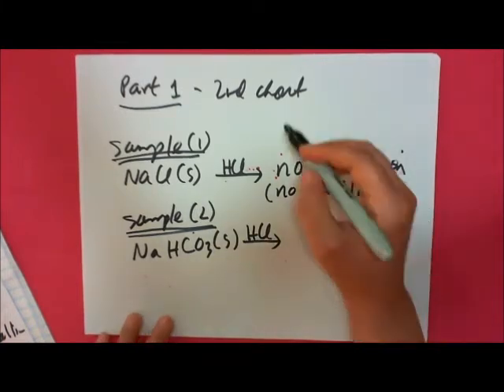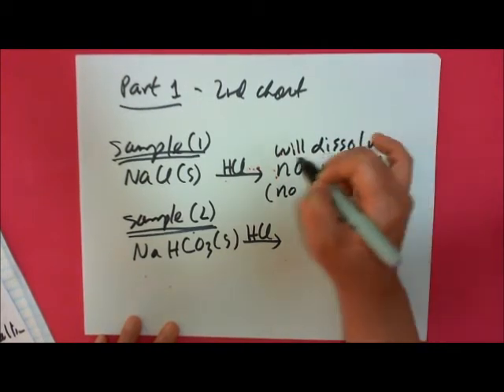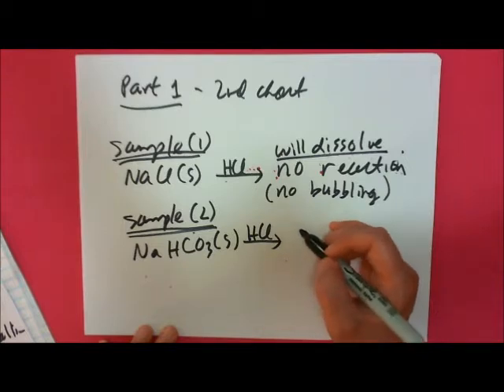What you will see is it will dissolve, but it shouldn't bubble. But your sample 2, the sodium bicarbonate that you get from the side shelf, is going to do the same reaction that your first reaction did. So your reaction is going to go forward.